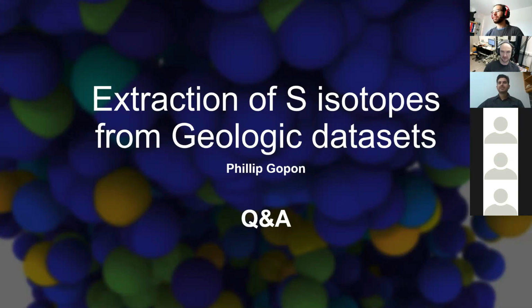It's not really the right way of doing it, but we were able to reproduce the analyses a number of times. So we're pretty confident that for some reason these conditions seem to work. Not 100% sure yet why. It probably has to do something with multi-hits, and we're still scratching our heads about that. But at the moment, we seem to be able to get the right answer, and do this consistently, and that's really what matters for us.